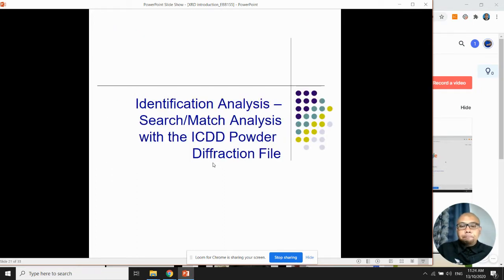All right. For XRD, normally we use the term ICDD Powder Diffraction File. They have a long name for this, the ICDD numbers. So try to find out what the ICDD numbers are. For first year maybe it's not important, but for mixed mode students, please make sure that you understand what ICDD means.